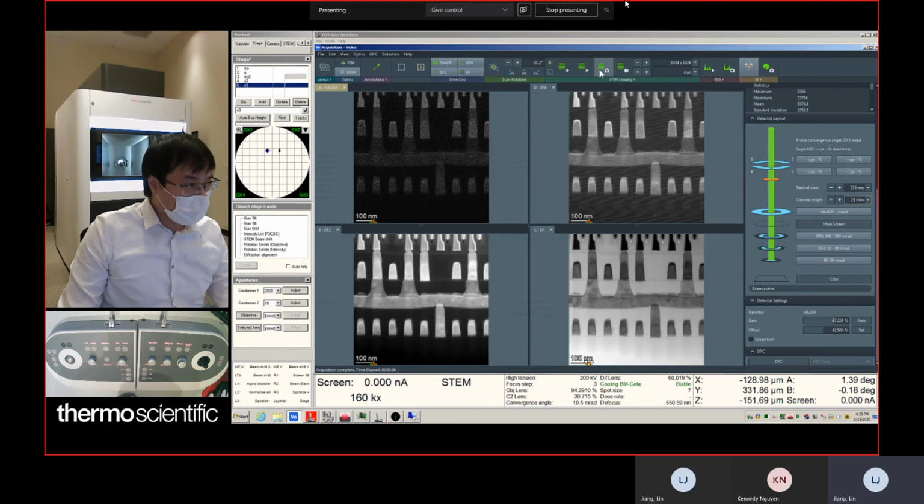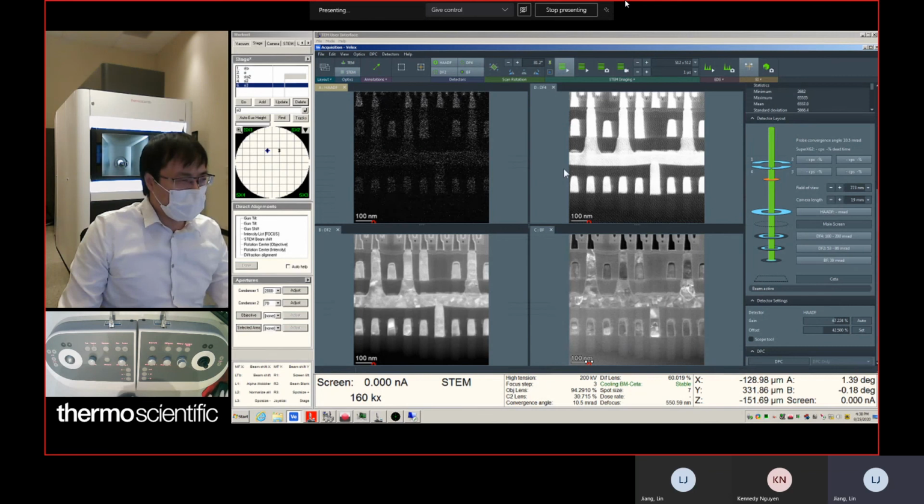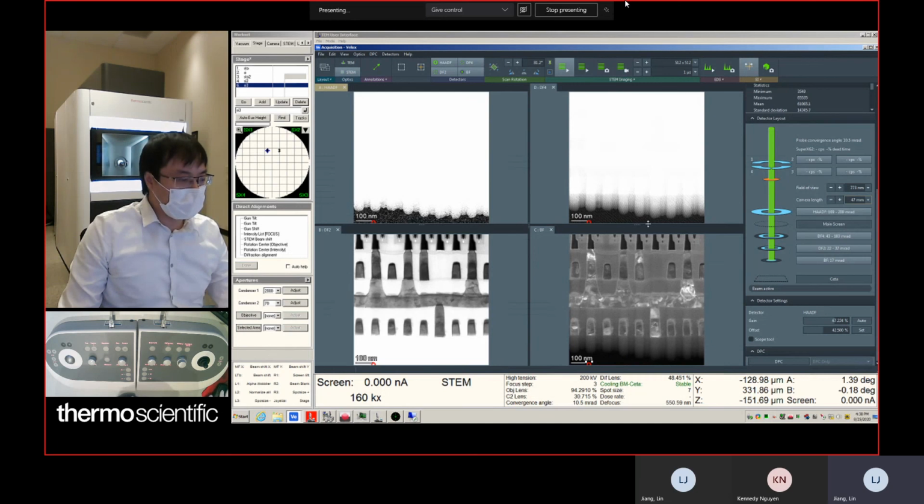maybe 19 to see how it looks. Still quite similar. Let's go a little bit bigger, 27. Maybe 47. We want to see the difference. 47. 77. We already got 77. Let's go. 47. Oh, interesting.